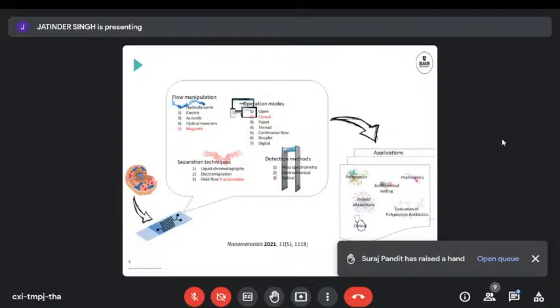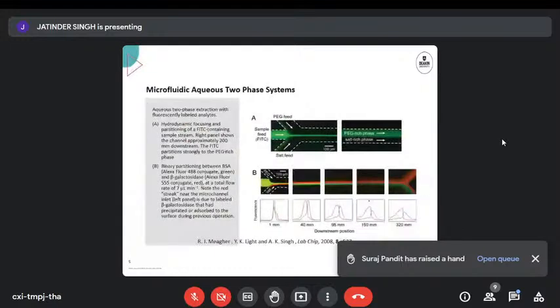Sensing with impedance is done as well. And of course, mass spectrometry, particularly if your application ends up in the proteomics, peptidomics, testing, then mass spec becomes your field. We'll also have a look at how we can actually start quantifying protein-protein interactions using some microfluidics. So again, we're back at our pictures of microchannels.